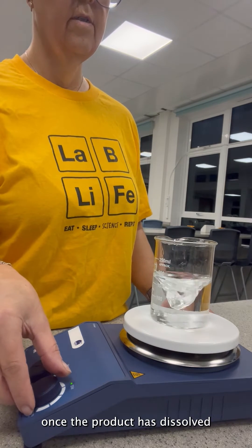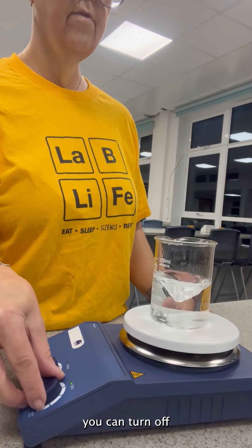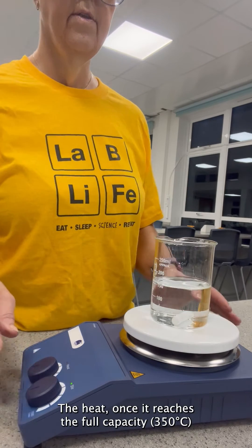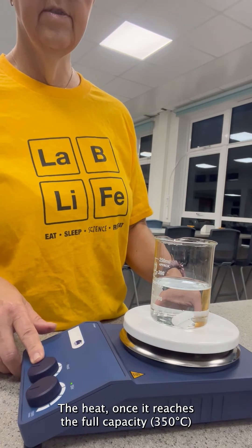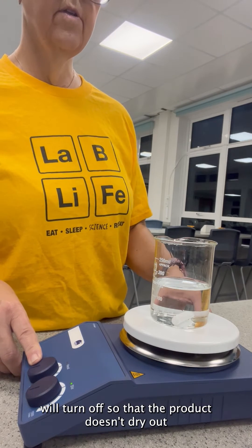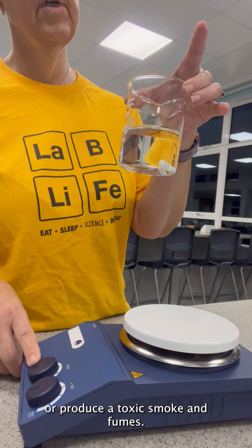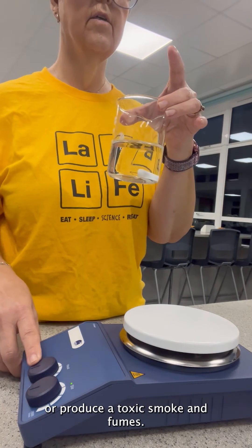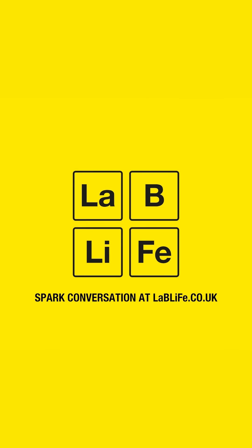Once the product is dissolved, you can turn it off. The heat, once it reaches the full capacity, will turn off so that the product doesn't dry out or produce toxic smoke and fumes. That will help you prepare.